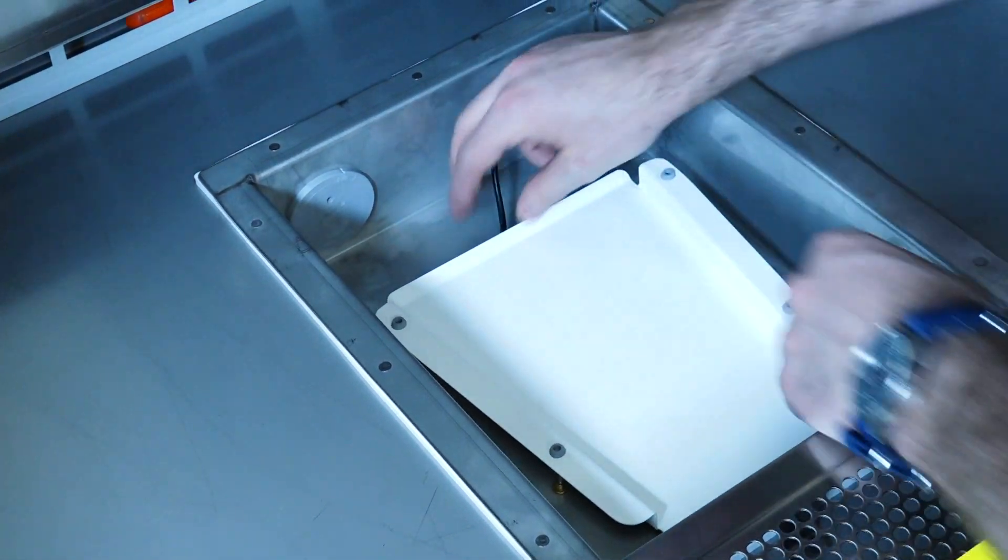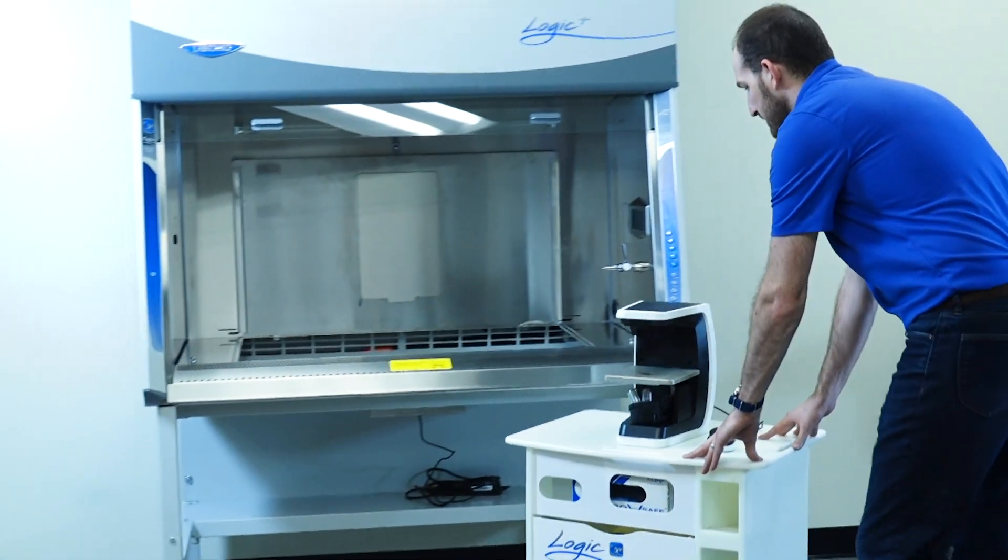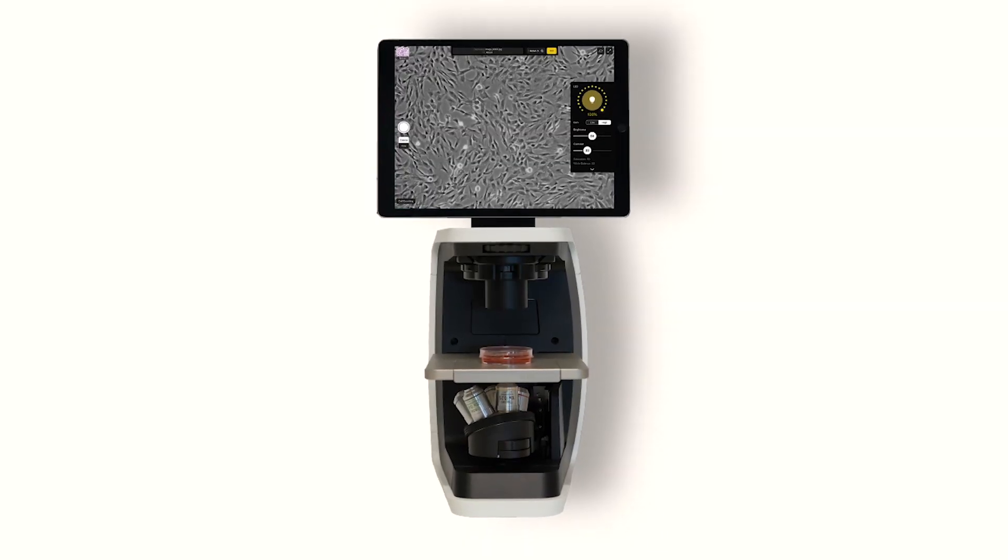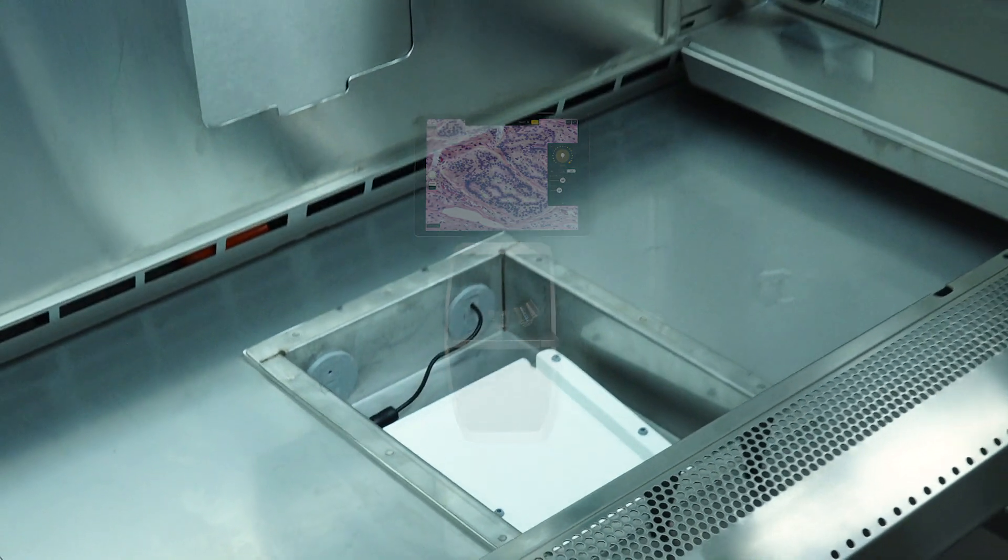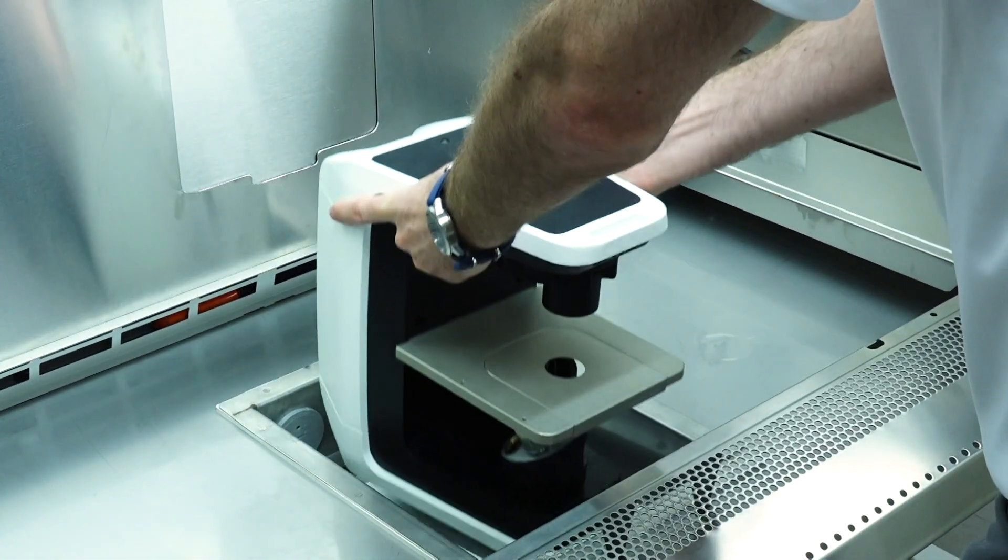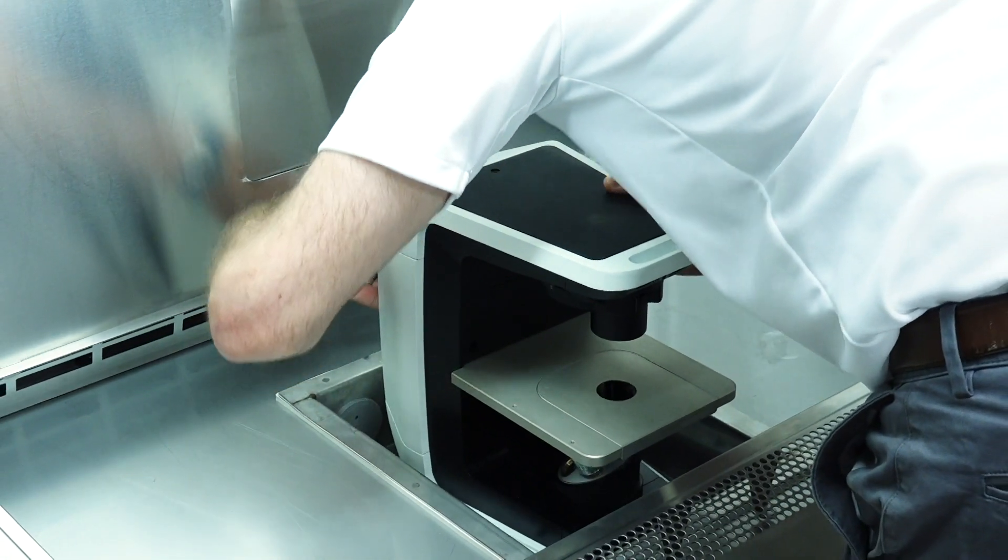You're now ready to install Echo's Rebel Microscope into the Rebel Logic Plus. Rotate the Rebel Microscope into the inverted or upright position, depending on your needs. Place the Rebel into the microscope sump and ensure that it's seated on the white scope carrier. Connect the power cable.